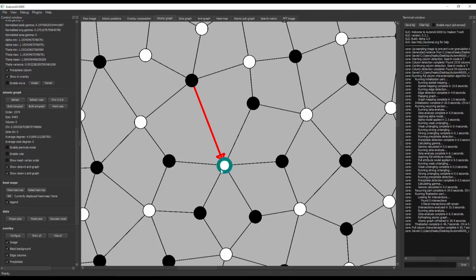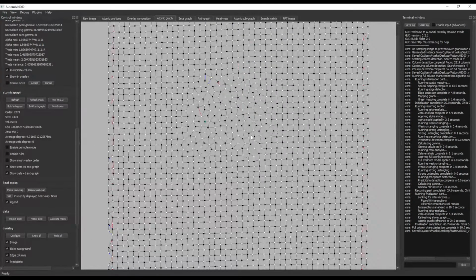But these kinds of 6 opposite plane nearest neighbor magnesium do sometimes occur in 6000 alloys, which is one of the interesting results that we noted in this work, because looking at these graphs for many images, we see that this actually happens sometimes.